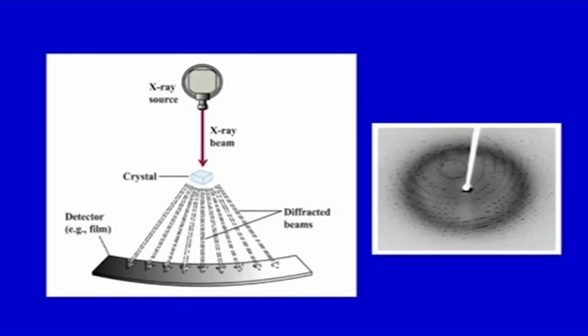So, if we summarize, there is an X-ray source, the crystal mounted in a loop is irradiated, and the crystal diffracts as per its packing and other parameters. Now, remember, as we discussed in microscopy earlier, the higher the angle of diffraction, that is, the more outer the diffraction from the center axis, the higher the resolution. The center is not diffracted.